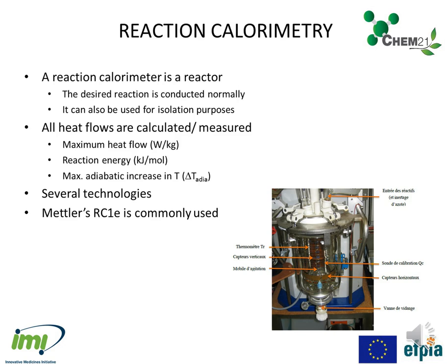A reaction calorimeter is essentially a reactor, which can also be used for process optimization. In the reaction calorimeter, we reproduce the operating procedure which we plan to scale up. After the reaction is completed and the thermal data recorded, it is important to isolate the product which has been obtained to make sure that the reaction worked as planned.